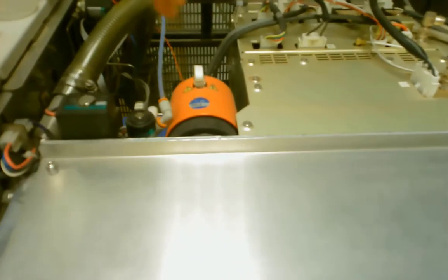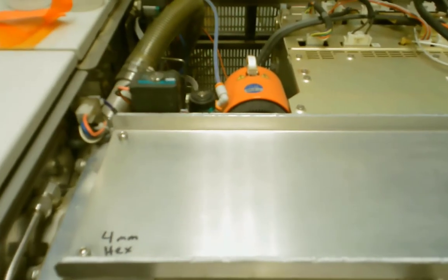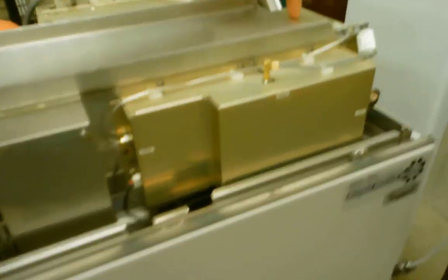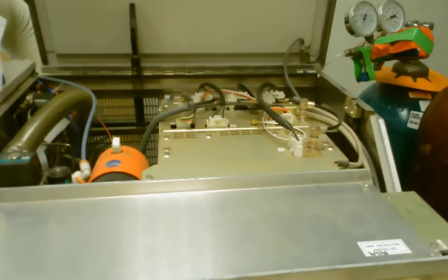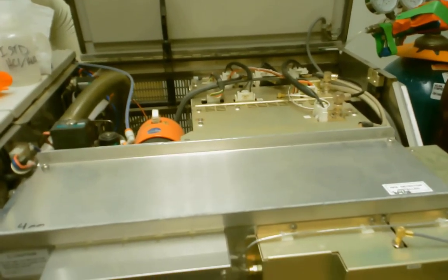On the back, this red part here, that's the pressure gauge. And then on the front here, we have the electronics, and on the back side here, these are for the detector system. And then the rest of the stuff in the back here is more electronics and power supplies and control modules and stuff like that.